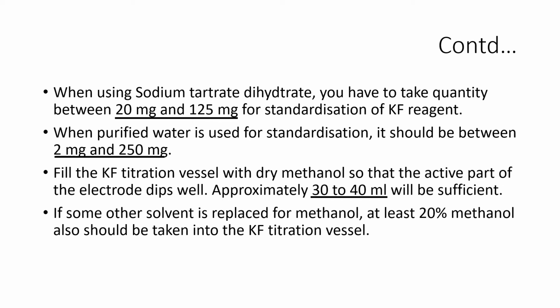If some other solvent is used in place of methanol, at least 20% of methanol also should be taken into the KF titration vessel. If diethylene glycol monoethyl ether or any other suitable alcohol is used, it is necessary to use about 20% of methanol with that solvent.